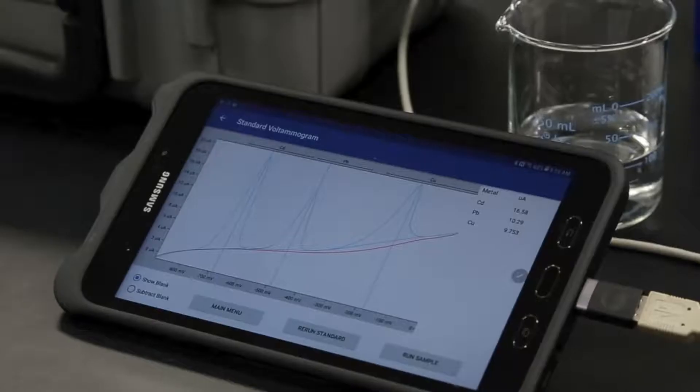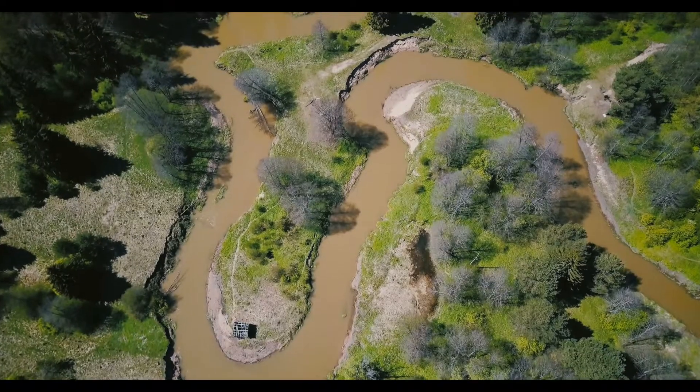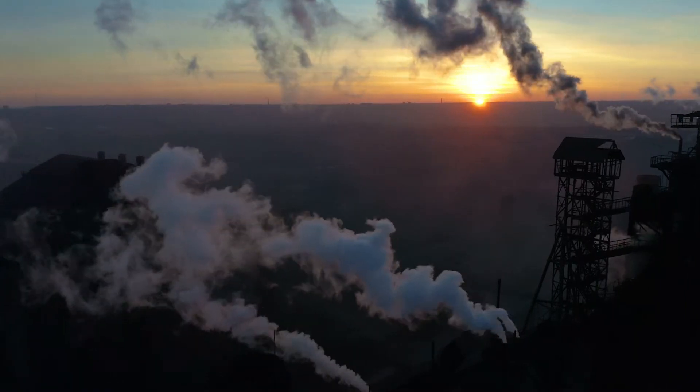The Microtrace PDV provides rapid results and detects trace metals down to 0.5 micrograms per liter, allowing for the immediate identification and resolution of on-site problems.